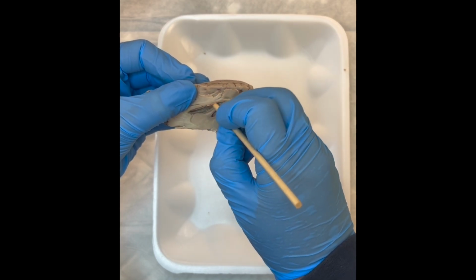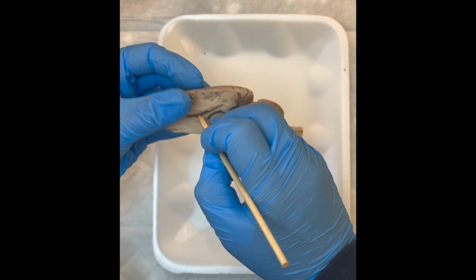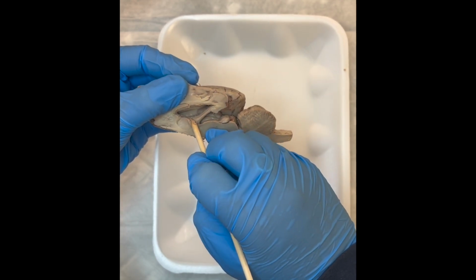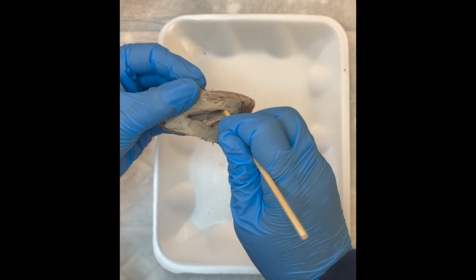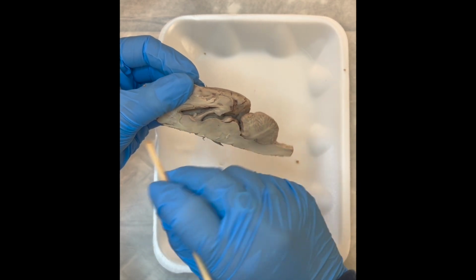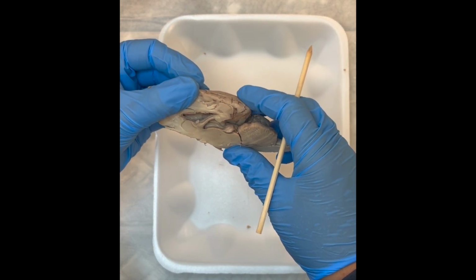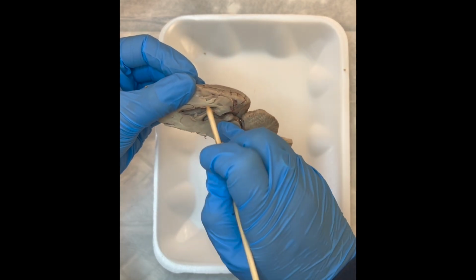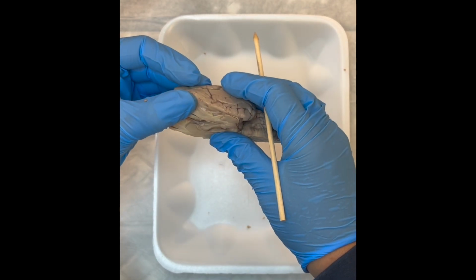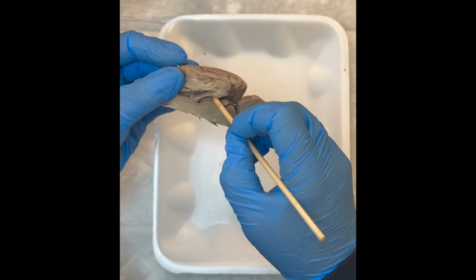And now I'm seeing into that lateral ventricle. It's quite a large structure. It's a fluid-filled chamber. Right, it contains that cerebral spinal fluid, and it's pretty decent size. So I just penetrated through that septum pellucidum into the right lateral ventricle. So fluid enters that lateral ventricle, and then it's going to meander its way down into the third ventricle.